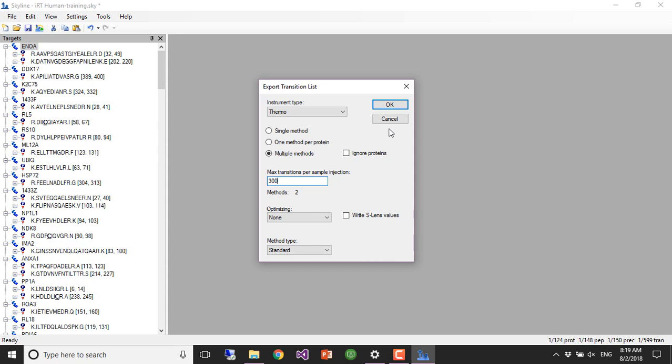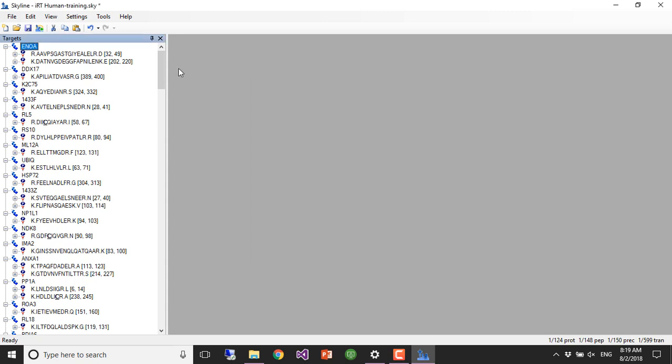Now 300, even for modern mass spectrometers, is a little bit much to get a quantitative assay, but we're really just trying to figure out where these things show up. So if we only get 4 or 5 points across the peak, that's not a huge problem. So that's what they did. It did take them 2 methods to measure all these things.